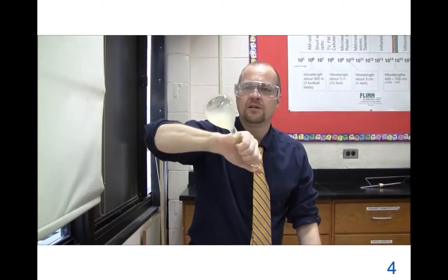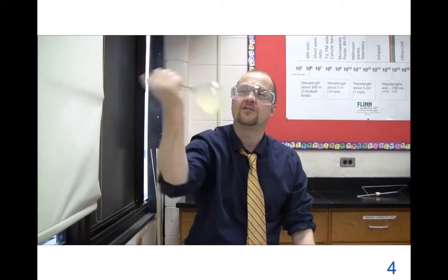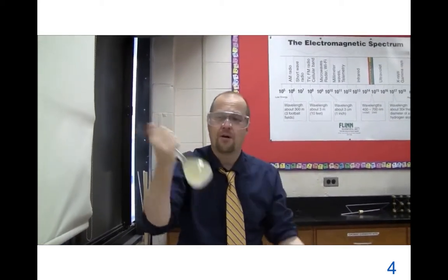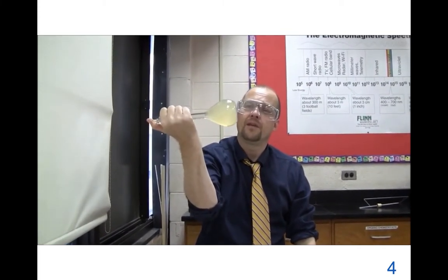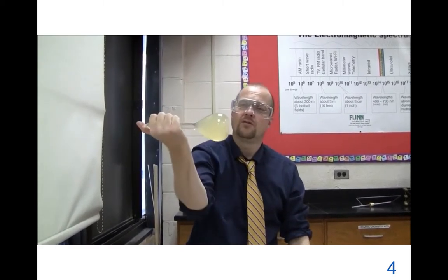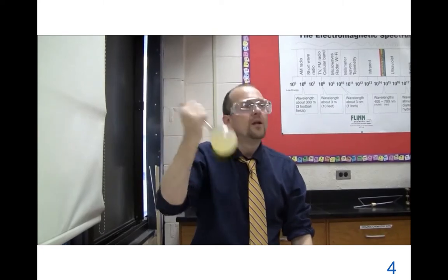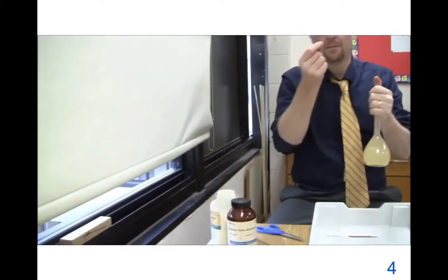Now, if it turns brown, that means there is some dissolved oxygen. And indeed, it is turning brown. It's quite hard to shake it because there's no air pocket to shake the liquid into. The brown is the manganese 2 turning to manganese 4.